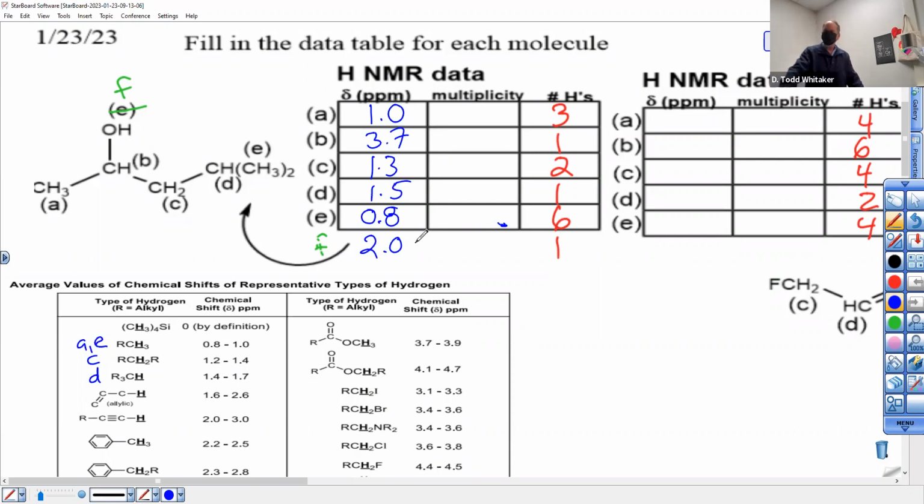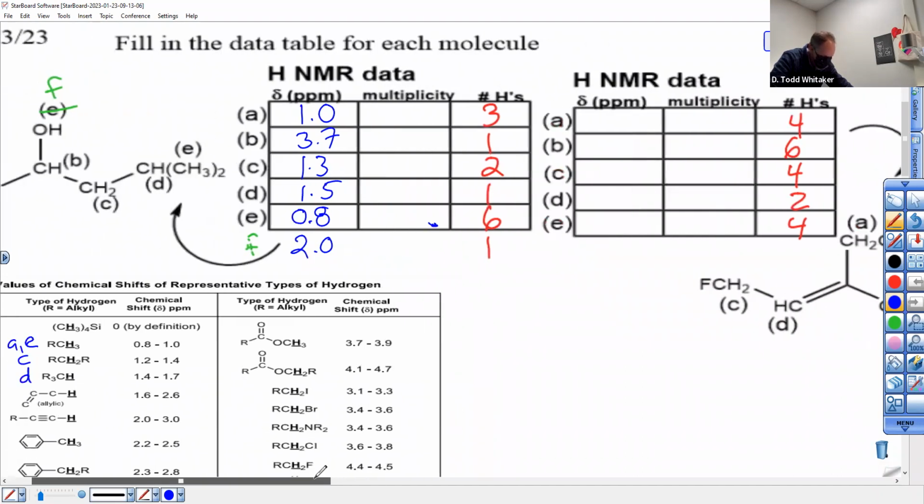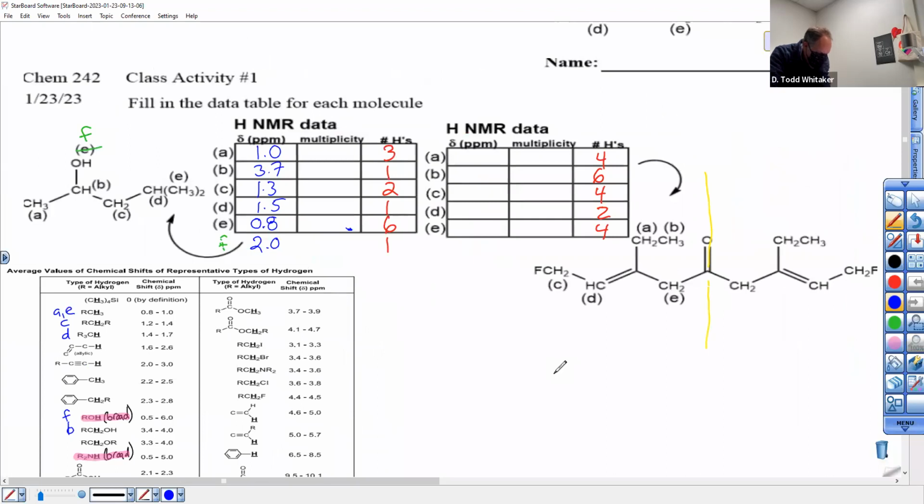In infrared spectroscopy, they're always broad for similar reasons. Yeah, so she's looking at lab stuff now. In lab we look at infrared, and there's hydrogen bonding effects in infrared spectroscopy too for the same reason. Now multiplicity. We're not doing multiplicity until we finish our ppms over here. We're getting more practice. Sadly, I got to shrink it down so I can see my molecule and the chart at the same time.